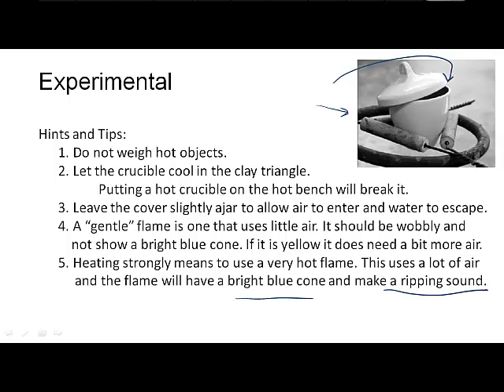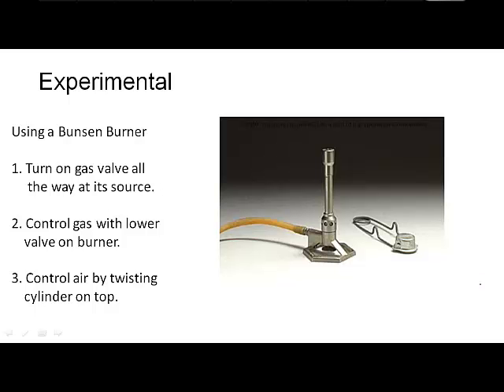Let's look at a little video of how to use a Bunsen burner. A Bunsen burner has really two controls. This is the tube that has the gas. You turn the valve on at the source of the gas all the way.